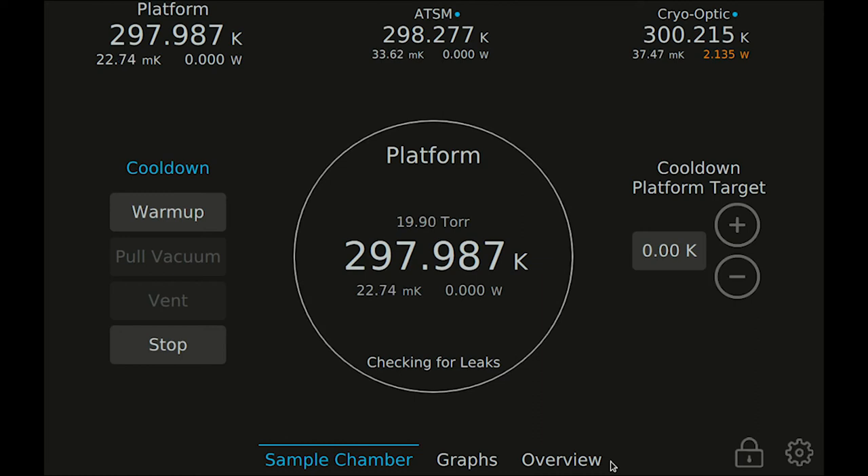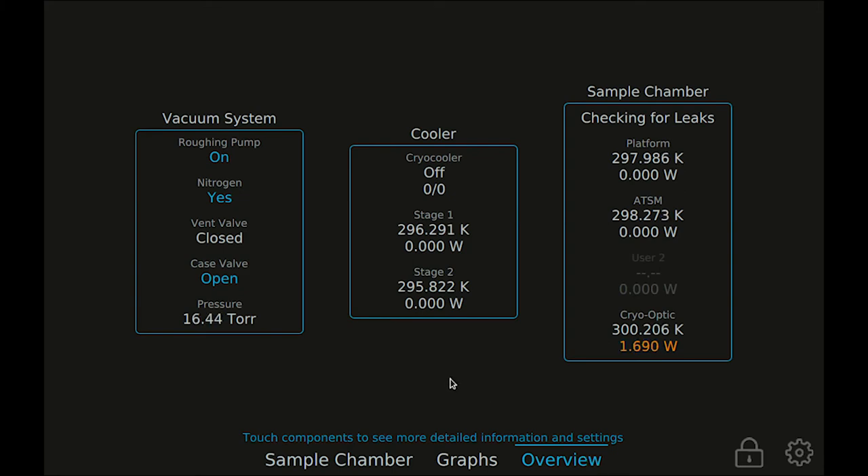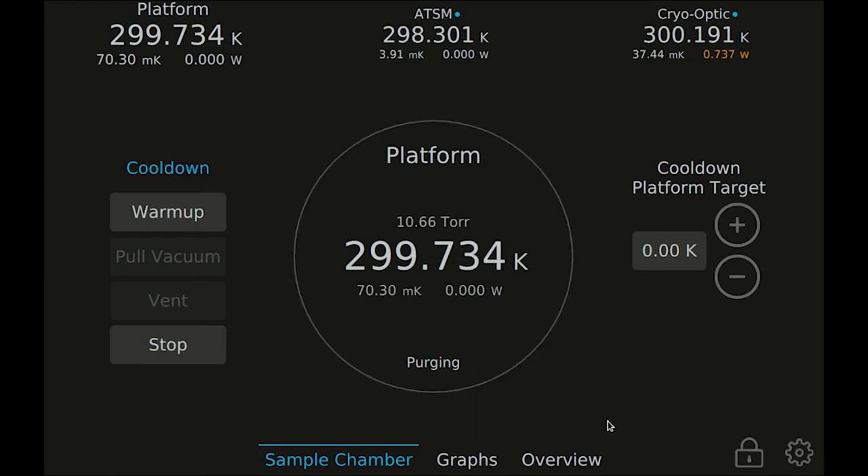The overview screen is the place to go if you want to watch the pull vacuum process in more detail. The bakeout completed and the system is now purging with dry nitrogen. After establishing a good vacuum level and finishing the bakeout and dry nitrogen purging, the cryo-cooler will turn on and the system will begin to cool to the target temperature.